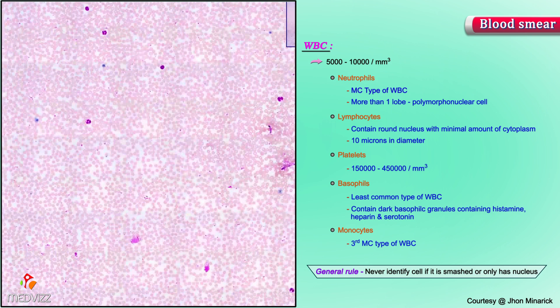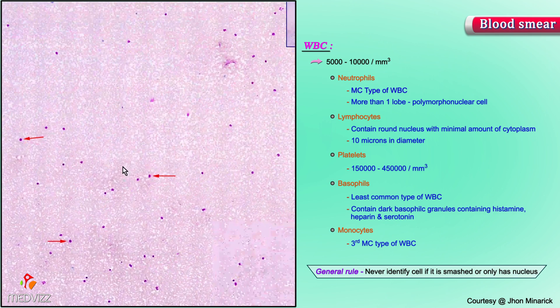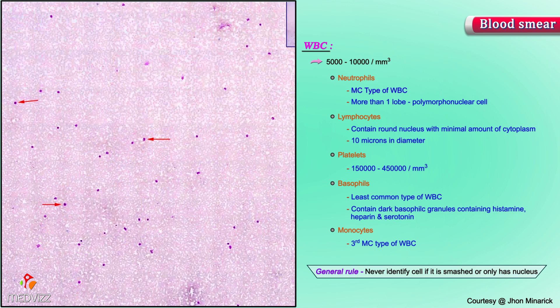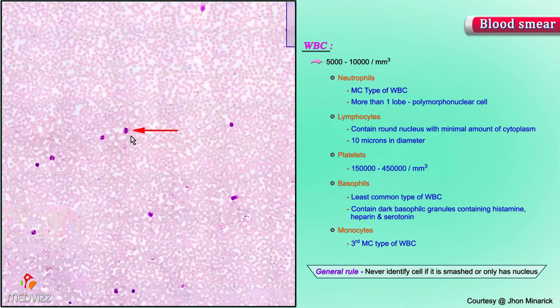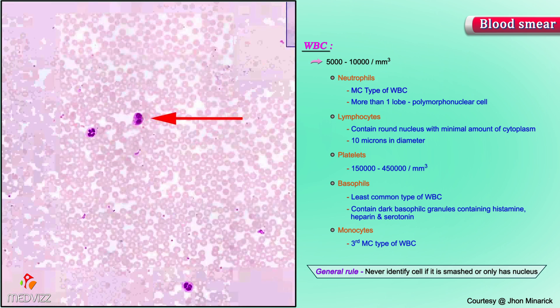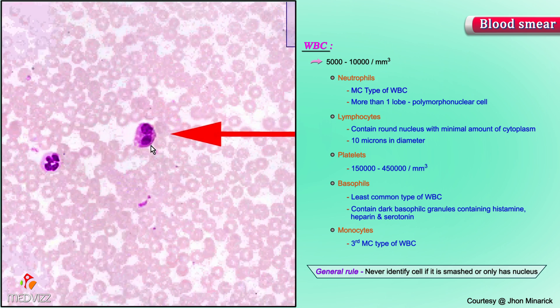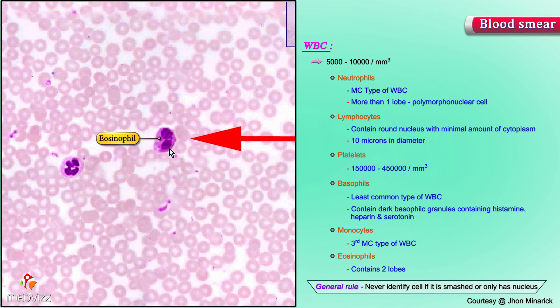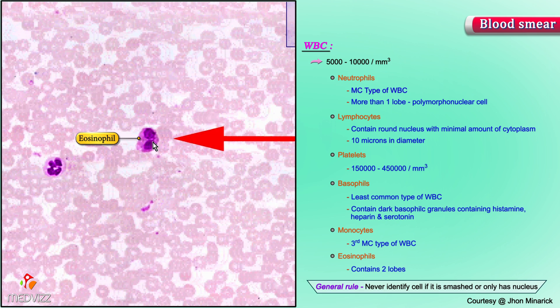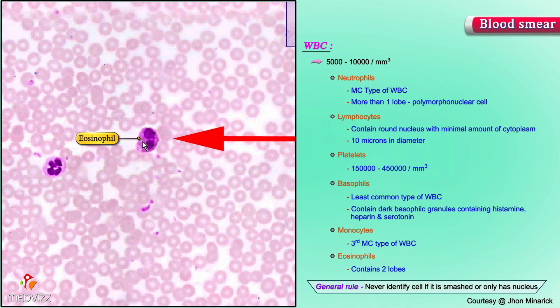Perhaps we can find an eosinophil somewhere. Eosinophils and basophils are generally not that common — basophils are usually less than 1%, and eosinophils are usually just a couple percent. This is a fairly classical eosinophil. Notice it only has two lobes; it never gets beyond the two-lobe stage, whereas neutrophils usually have more than two lobes — the average is about 3.4. The number of lobes in an eosinophil is only two, and you notice how the granules are a little bit redder and much larger. That's how you identify eosinophils.